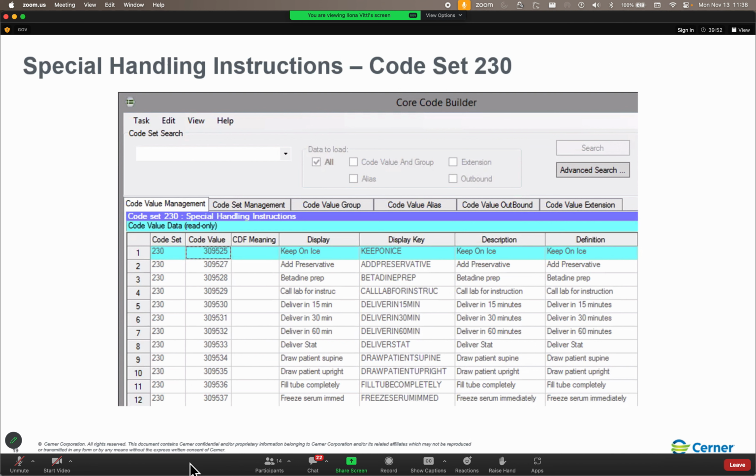So if you want to have different separate transfer containers, maybe one's got dry ice, one's got wet ice, and one is just a box, then you need to be able to create different transfer lists based on the transfer specimen. In the case of our running to the grocery store, we're going to have ice cream soup by the time we get home. And if it's bad enough, we may even have soaked in the cereal box.